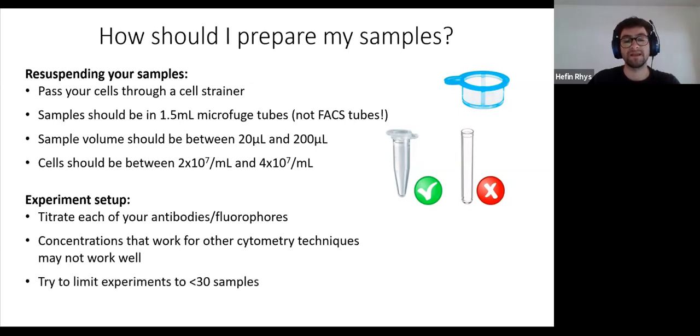And at least to begin with, I would suggest that you limit the number of samples that you include in any one experiment. For most people, 30 samples would be a big experiment on the ImageStream because the acquisition takes longer. And if you have large densities of cells, then that may not be the problem. I had one user who ran 200 samples in 2 days because she was working with yeast. But I would start small. I've also run assays where 4 samples has taken all day.